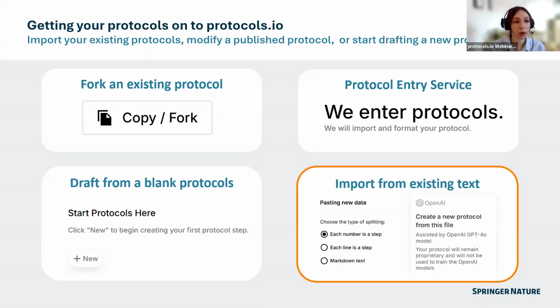So in terms of getting your protocols onto Protocols.io, this is a refresher to let you know all the different ways that you can do that if you aren't familiar already. So first of all, any published protocol or protocol that you have access to on the platform can be used as a template. So you can find a protocol, you can create a copy or a fork, which will create your own private editable copy that you can then adapt as you see fit and edit for your purposes.